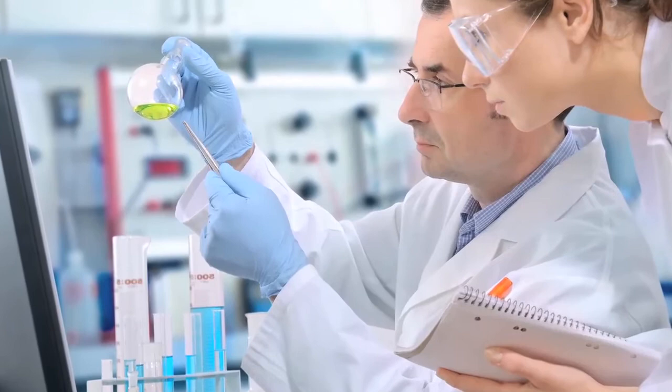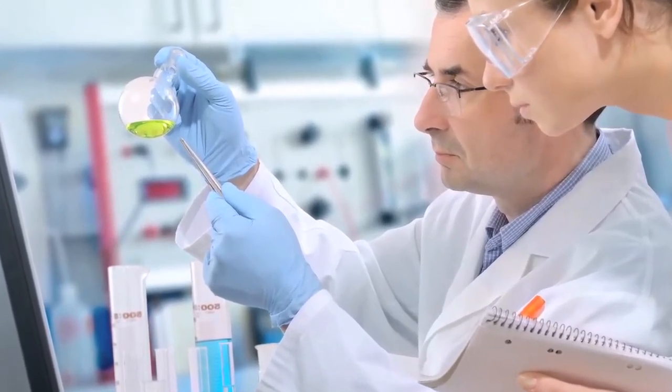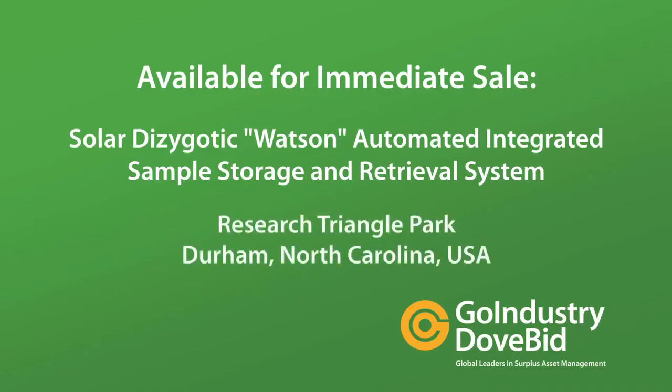On behalf of our client, a major pharmaceutical company, GoIndustry is offering for purchase a DNA sample freezer storage system, the solar dizygotic Watson automated integrated sample storage and retrieval system, originally utilized in Research Triangle Park, Durham, North Carolina, USA.